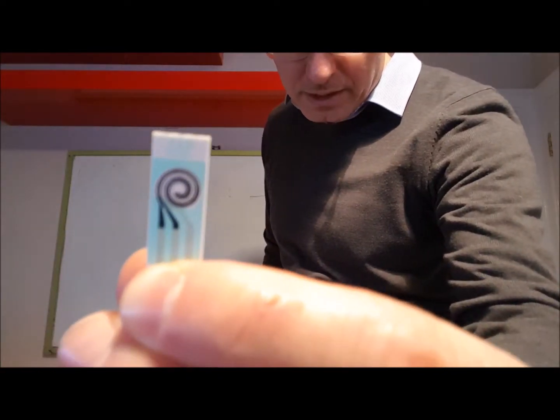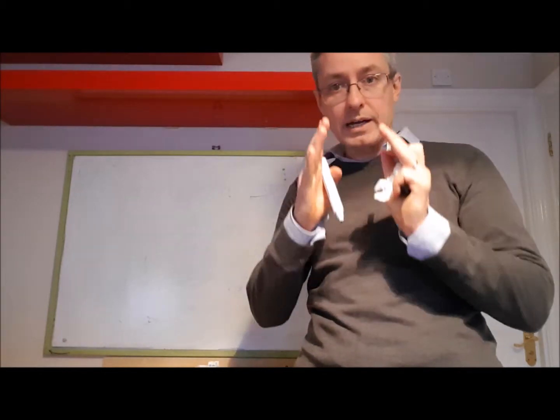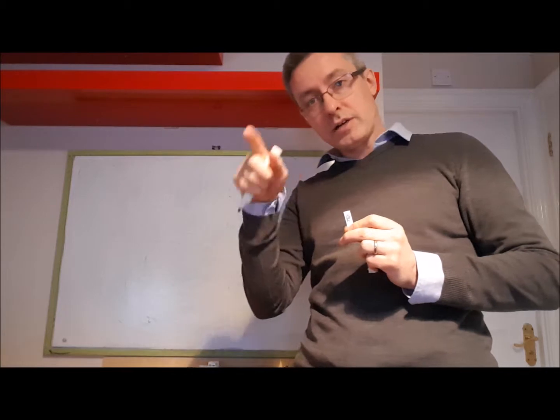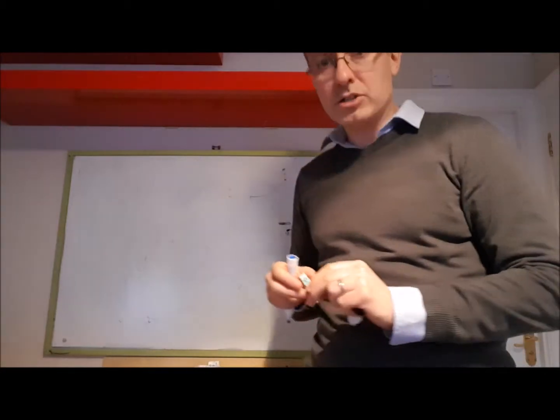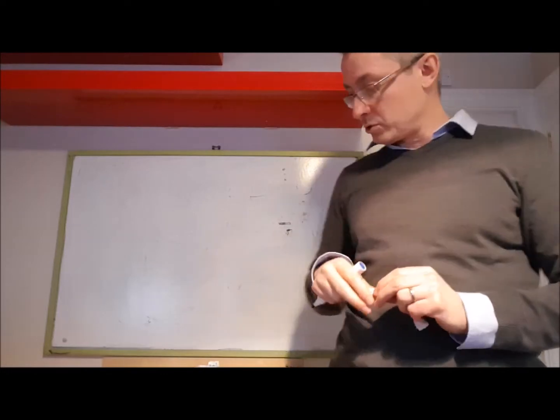So you could have, now these are spirals, but spirals are really just lines of electrodes. So we have these kind of spiral electrodes. We have sort of two lines, and we've just wound them up into a spiral. So it's a very efficient way of having effectively two line electrodes. And we're saying, okay, so you have these two lines, and you could use them to measure the resistance or conductivity across those two electrodes.